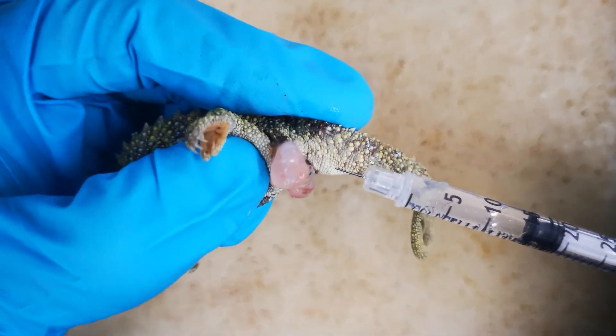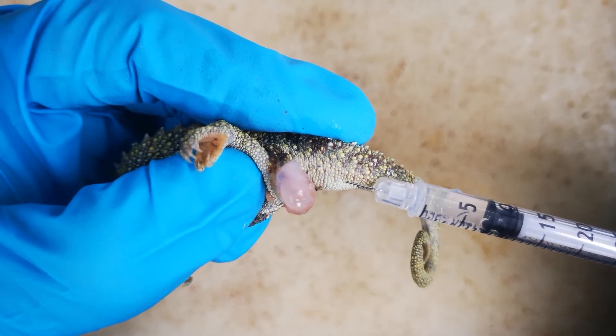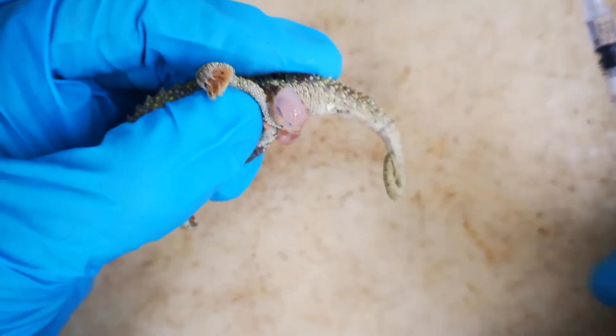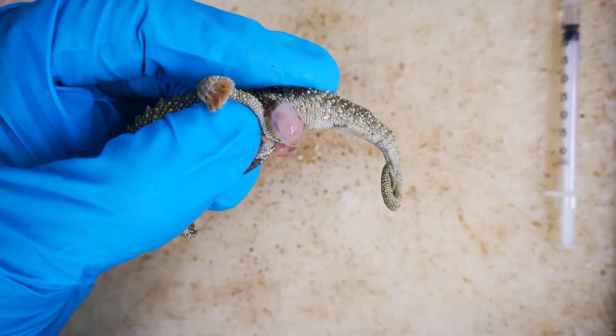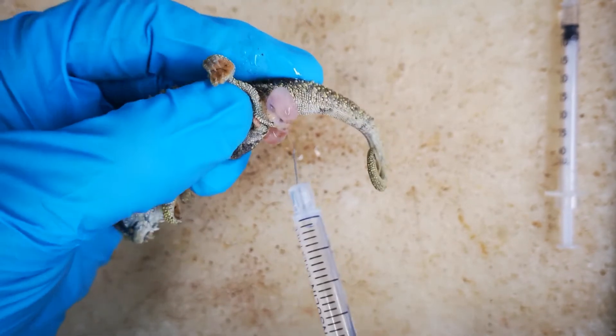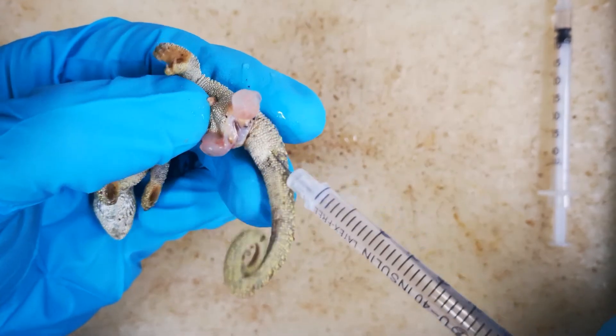Using gentle, constant pressure, fluid is then injected. Notice how, although the syringe is inserted only on the left side, it is filling both hemipenes. This does not always happen. Once satisfactorily averted, the external surface is sprayed with high concentration ethanol.